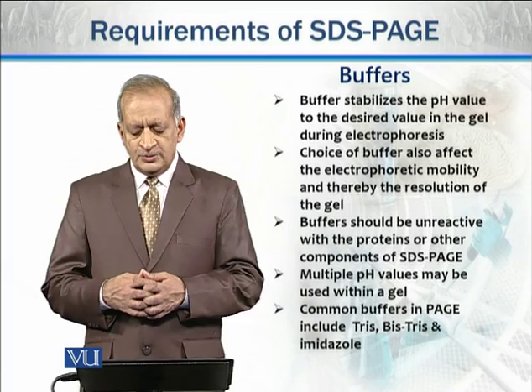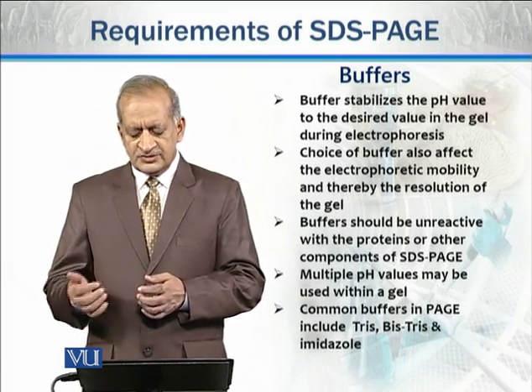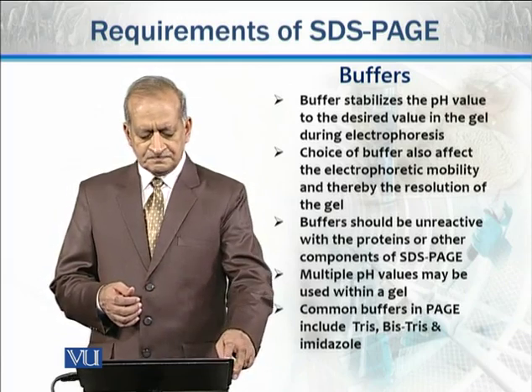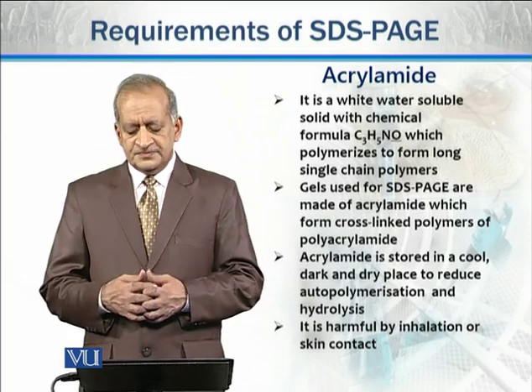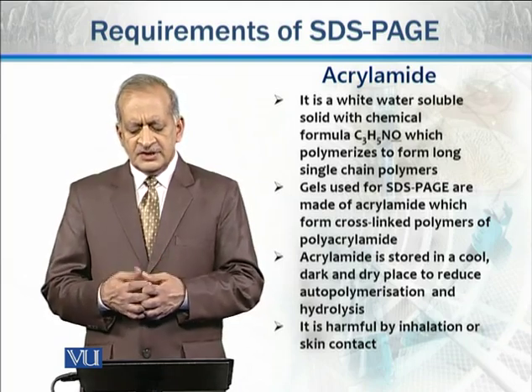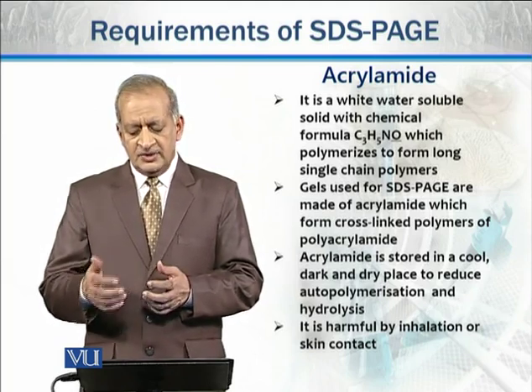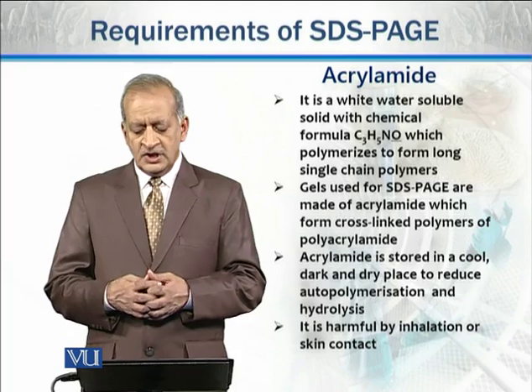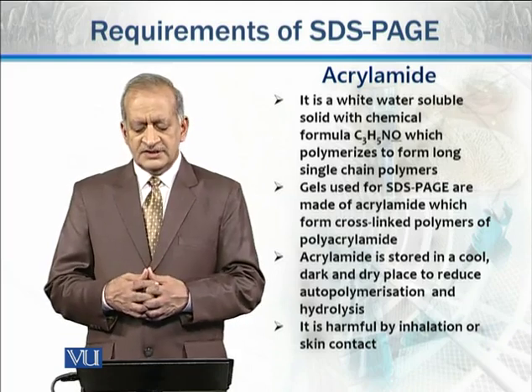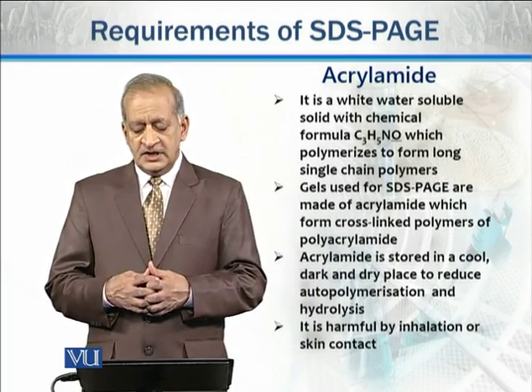Common buffers in page which are used include Tris, Bis-Tris and imidazole. Other buffers are also used. Then acrylamide. Acrylamide is a white water soluble solid with chemical formula C3H5NO, and this polymerizes to form long single chain polymers.